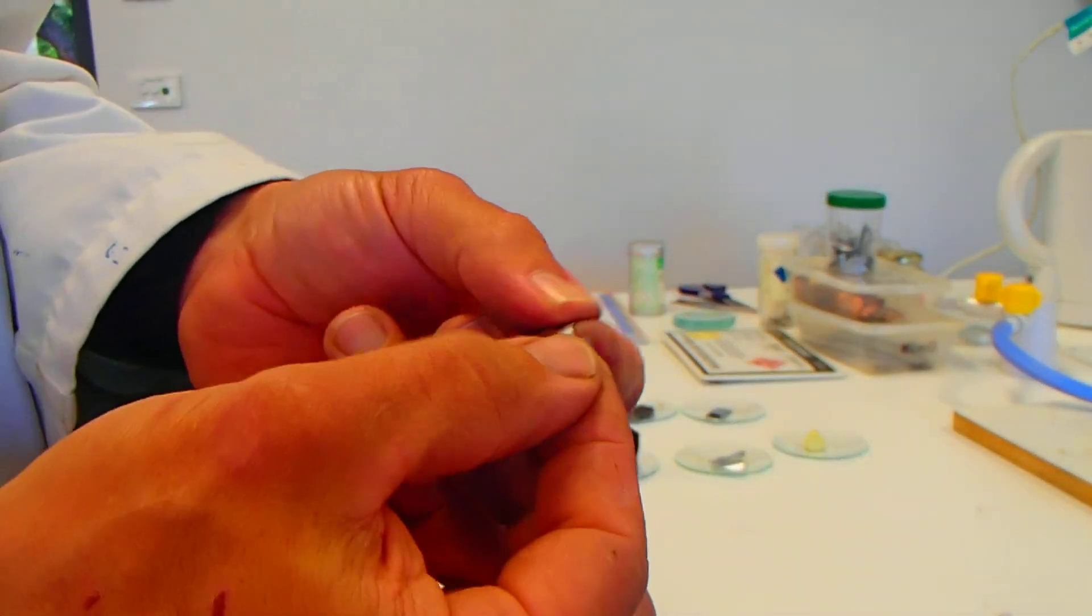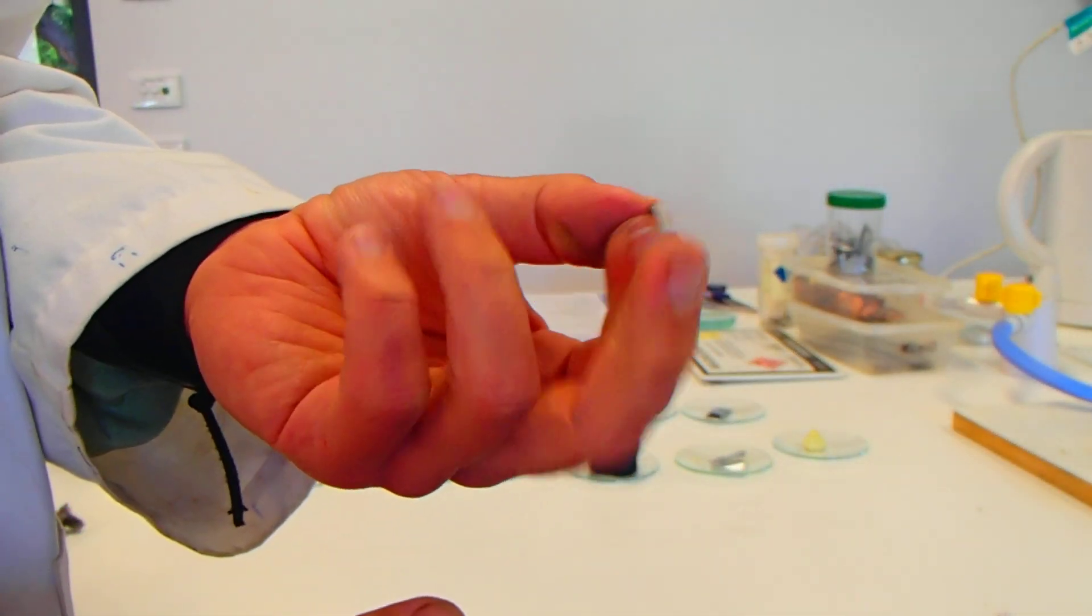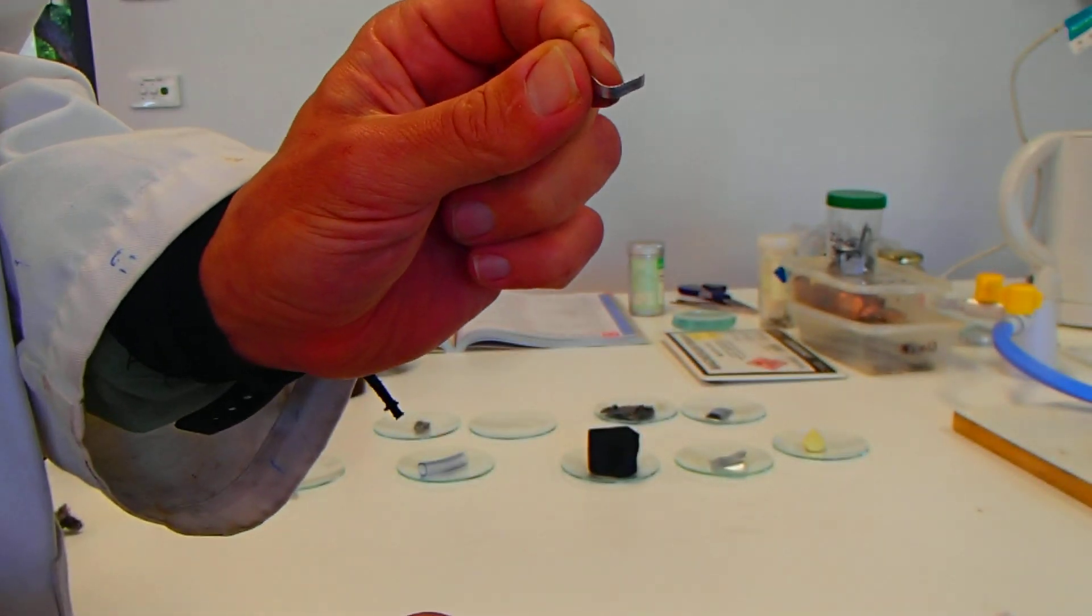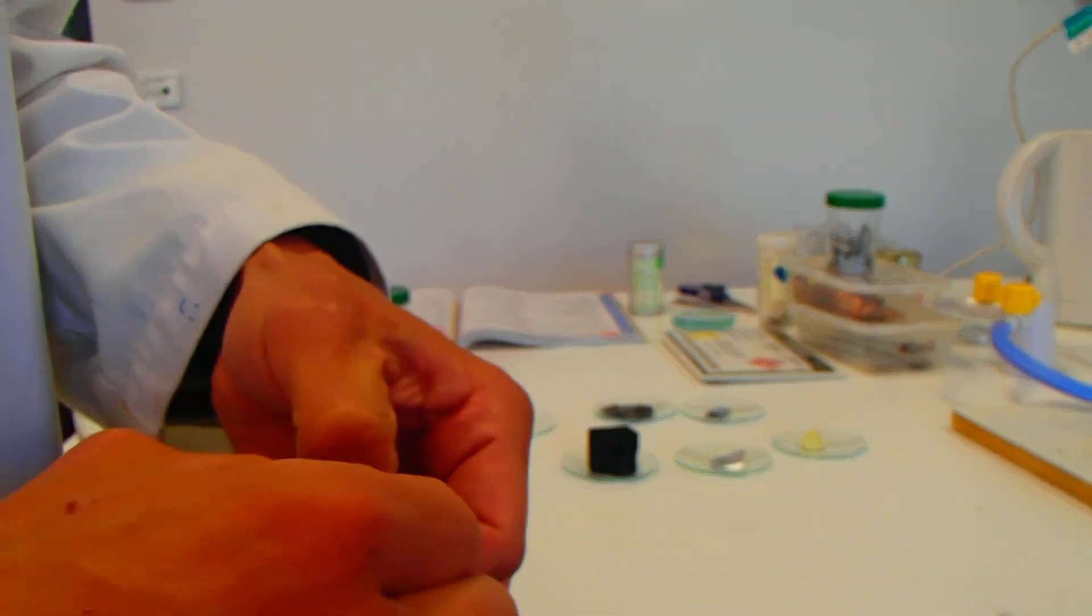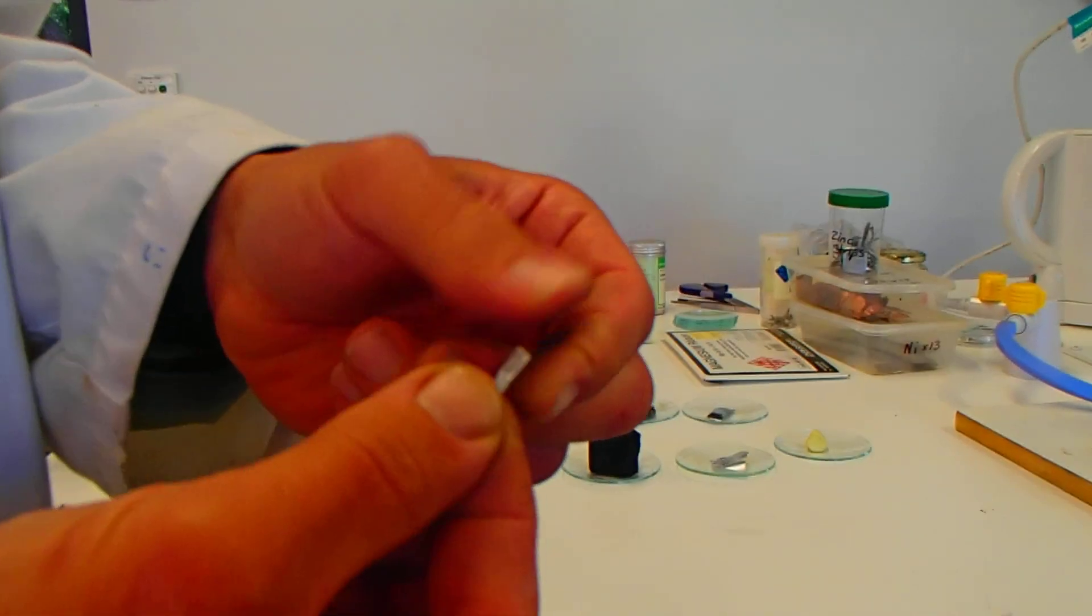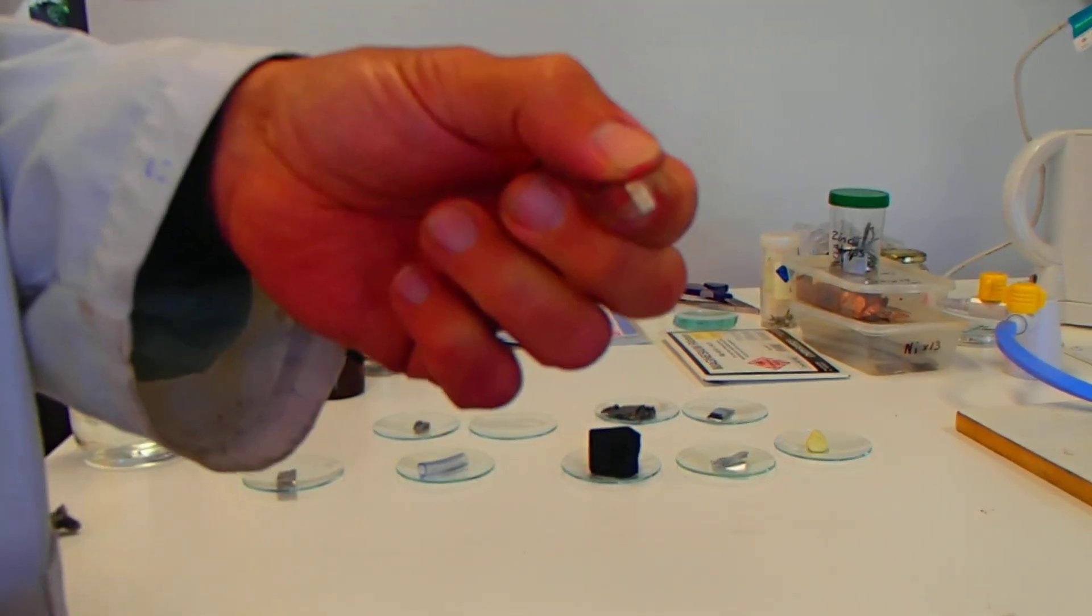The magnesium sample. Easily bent. Quite stiff. Similar to the zinc. Keeps its shape. Tears a little bit. Yeah, I can tear it there with some effort. So that's the magnesium.